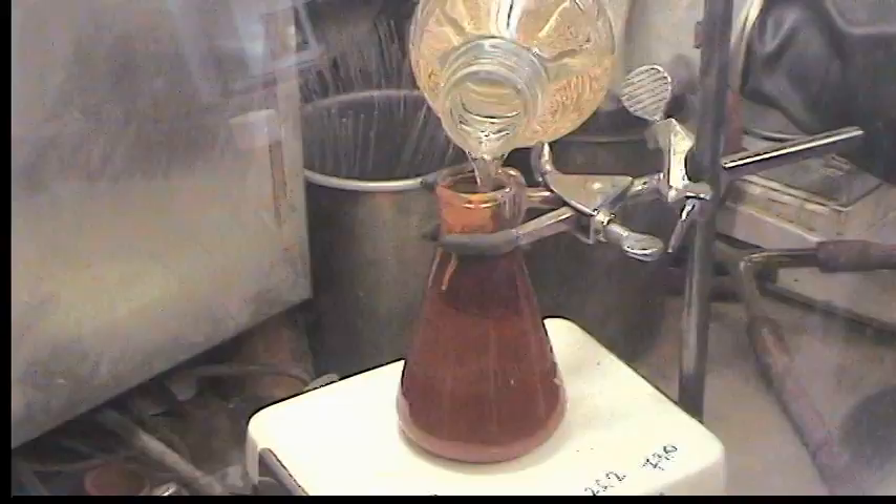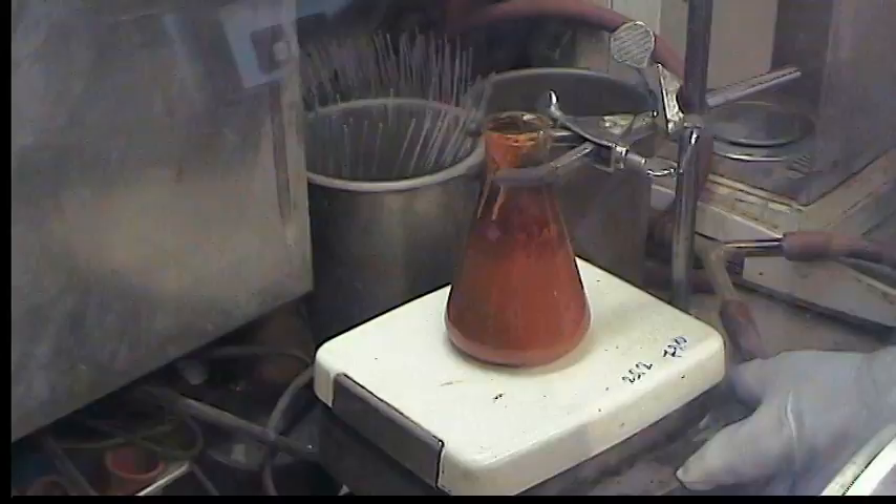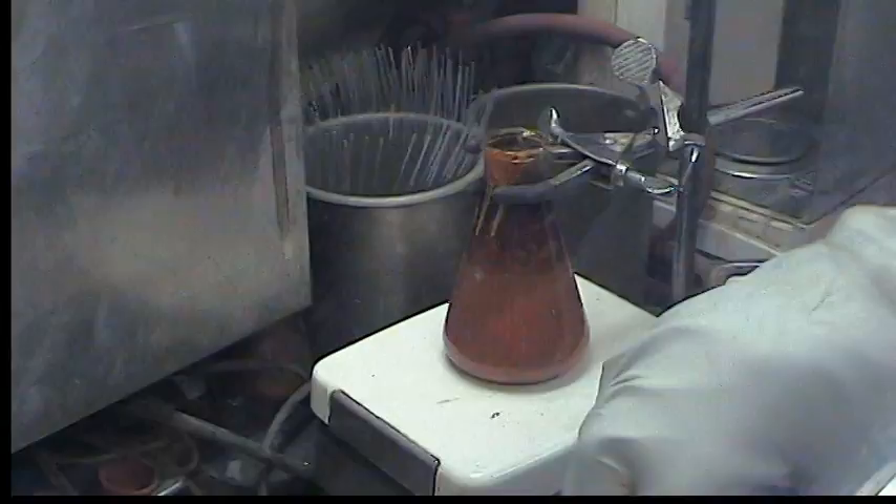I'm going to add roughly 200ml of THF, maybe closer to 250ml. And this is just going to stir. More THF doesn't hurt in this case — it's kind of like washing the product a little early.